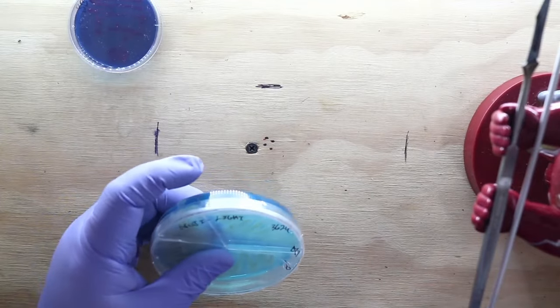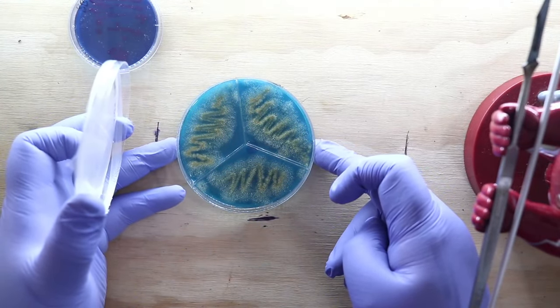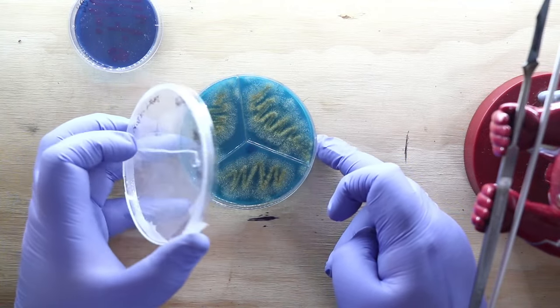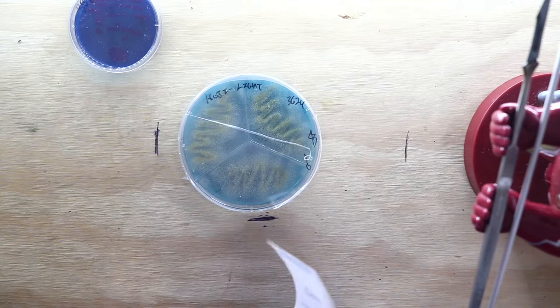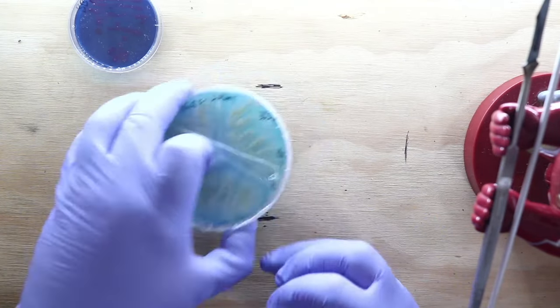It happens. This one I'll close back up fairly quick since we've been working with stuff. So everybody get a good look at it now. That is mold. That is Koji mold. Screenshot. It is one of the most beautiful organisms on this planet, and one of the most useful. Oh my god, that smells so good. My mouth is watering. It smells kind of floral, fruity. Yeah, it's flowery, fruity, fermenty. It hits you right in the jaw, and your mouth starts watering.